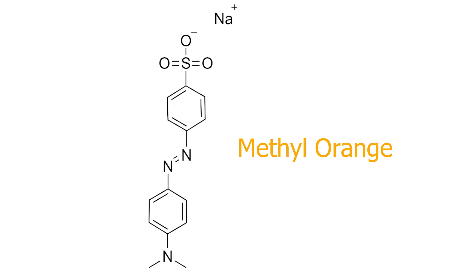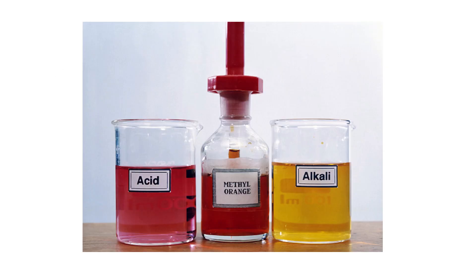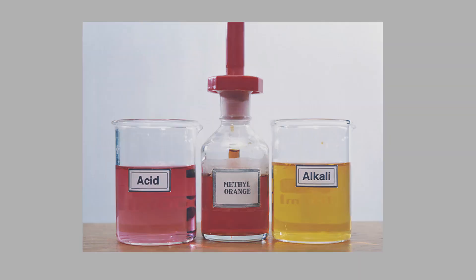In today's video, I am going to be making methyl orange from sulfonylic acid. The main use of methyl orange is as a pH indicator for doing titrations in a lab.